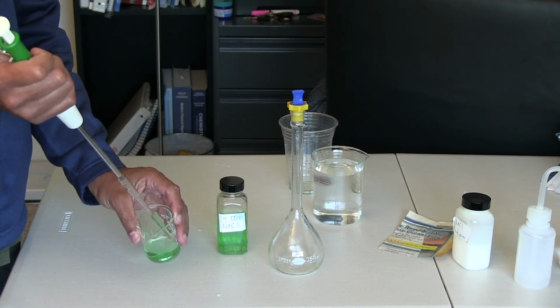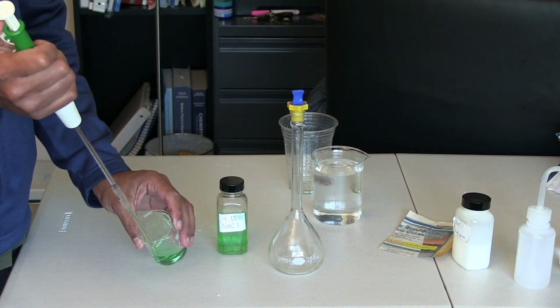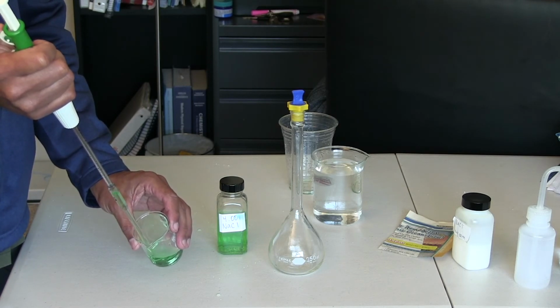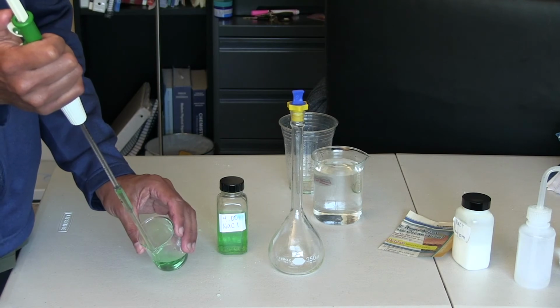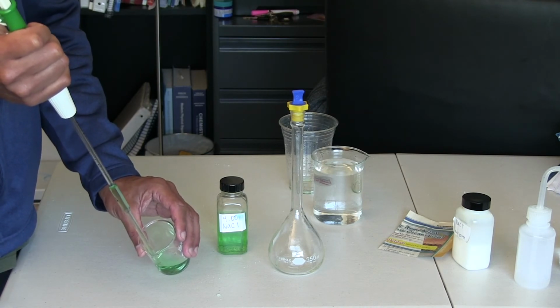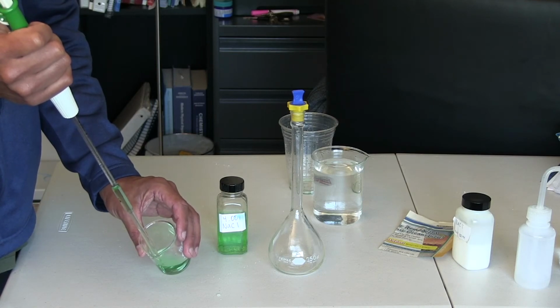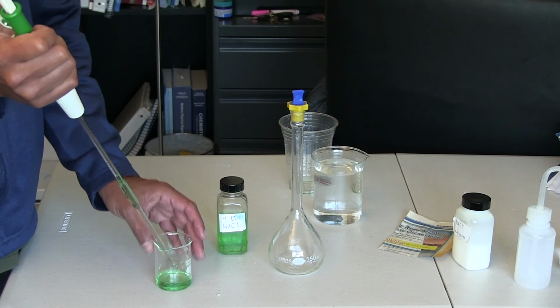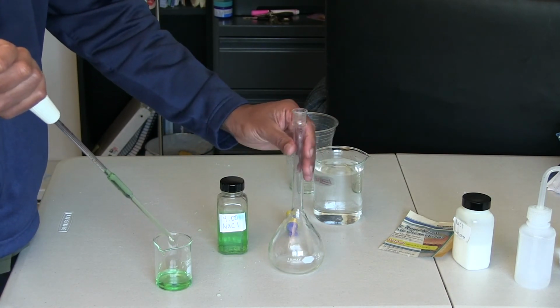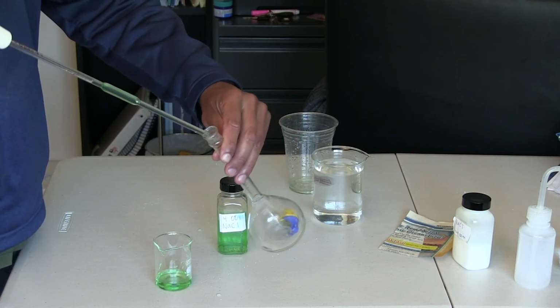This is not the right size volumetric pipette, but you always want to use one of these when you're transferring liquids from one solution to another. You are not allowed to use a graduated cylinder. I mean, you can, but normally we don't use graduated cylinders for this purpose. So you're going to obtain the amount that you need. You might have to use the pipette more than once. And this is going to go in there like this.